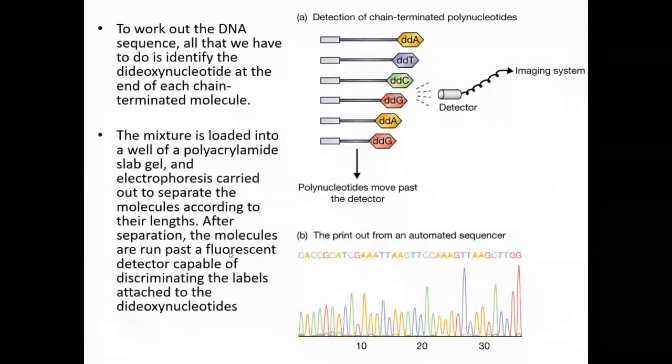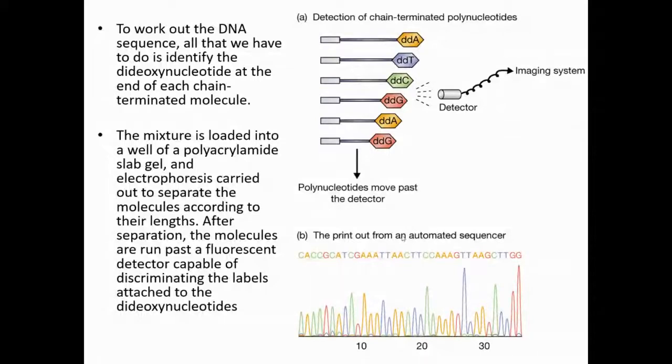Basically they incorporate a fluorescent dye into each individual dideoxy nucleotide.